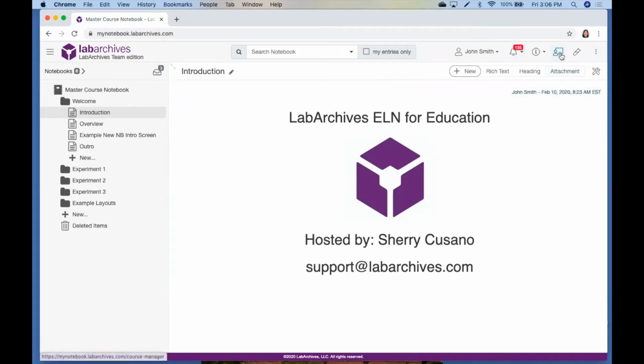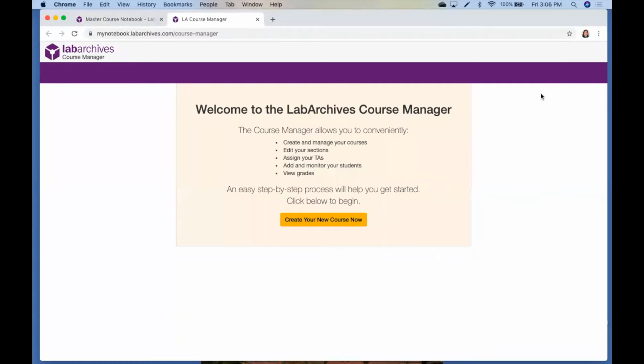After you've created your first course, you'll also notice there's a Course Manager icon at the top right. Clicking this icon will also take you to the Course Manager. To create a new course, click Create Your New Course Now.